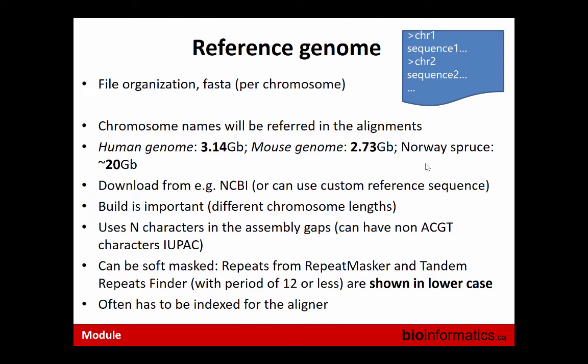So what is a reference genome? Reference genome, as I just said, is a sequence of ACGT. Sometimes, if you take the human reference genome, hg19, it's not the latest version, but it's the most popular version for analysis, and if you try to search for any letters but ACGT, you will find some. You actually find three letters which are not. For some reason, the authors of this build put some. So there is a Y letter which represents several nucleotides. So in the new build, we will have more of those. So the genome actually will not look traditionally like a sequence of four letters.